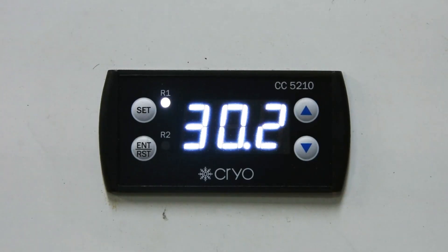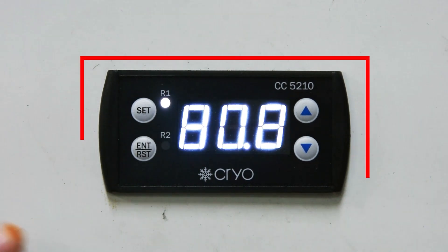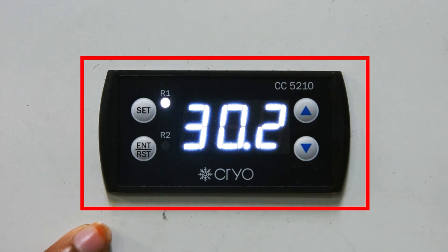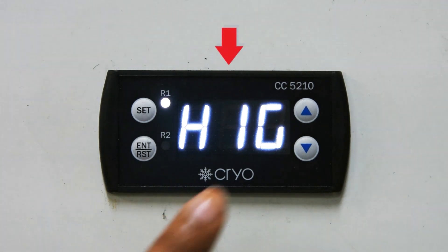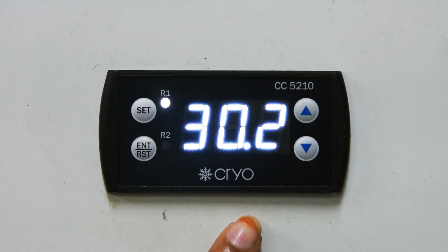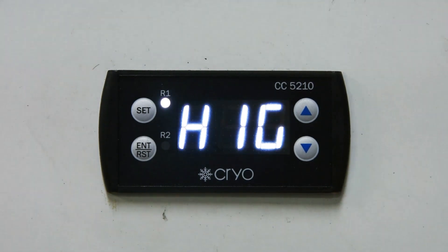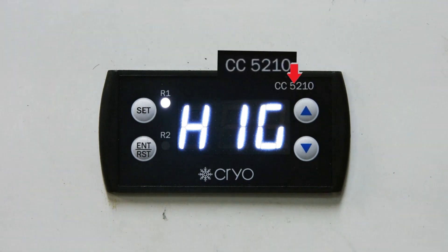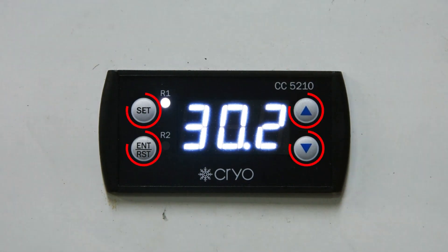In this video we will see the setting of a cryo controller. The temperature range of this cryo controller is 2 to 8 degrees. The controller is currently showing 'High', meaning it is not in range — the current temperature shown on the display is 30 degrees. The model number of this cryo controller is CC5210, which is also mentioned on the display.